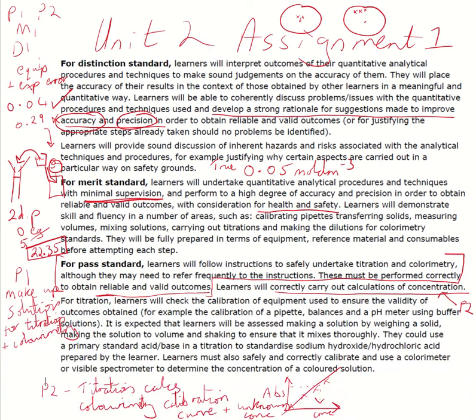So you need to try and improve the titration practical itself and the colorimetry too. So there's various ways that we can do that. For example, the simplest one, more repeats. You could look at, say, using different equipment for the titration rather than relying on your eyes for the color change. You can Google pieces of equipment which can pick up the change at the bottom in terms of the color when the indicator's changed.